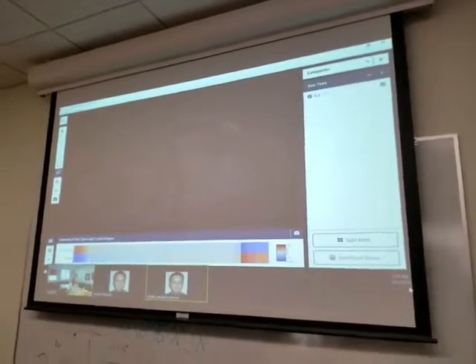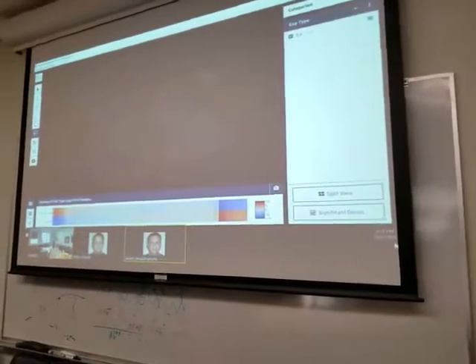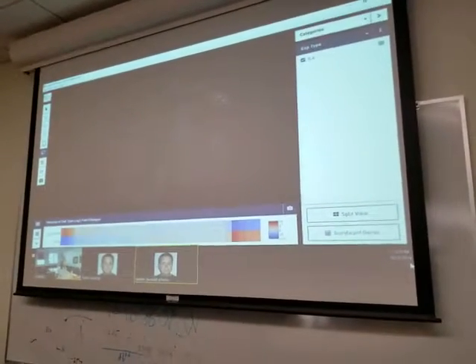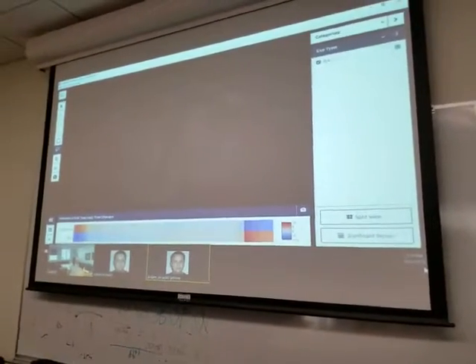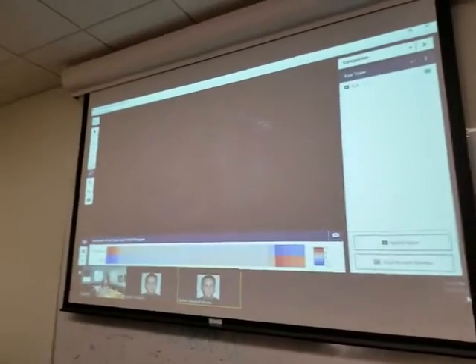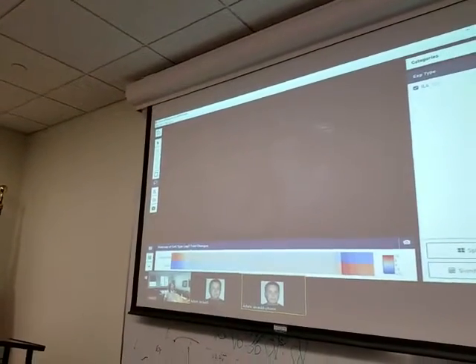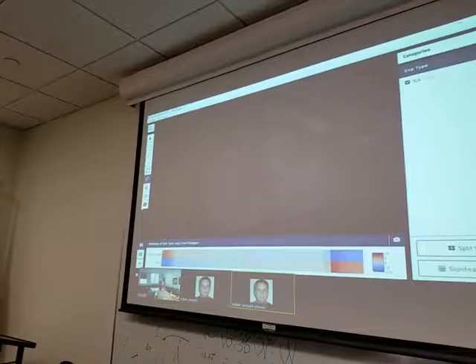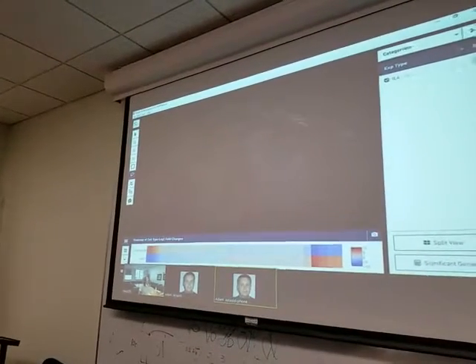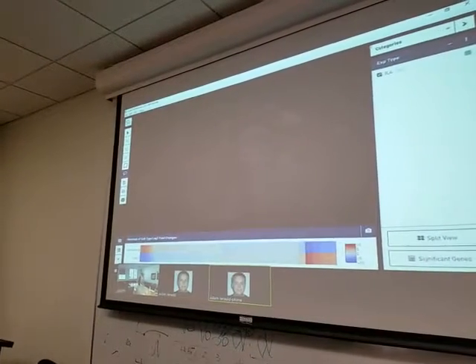Or I guess you could even do a lasso tool and maybe get that cluster and then do this within that cluster, right? In other words, we're interested in the upper right cluster, IL4R, only in B cell, but IL4 receptor positive, in that one cluster up there. Yeah, it's a good question. So we've got it right now currently. I don't think you could do that.